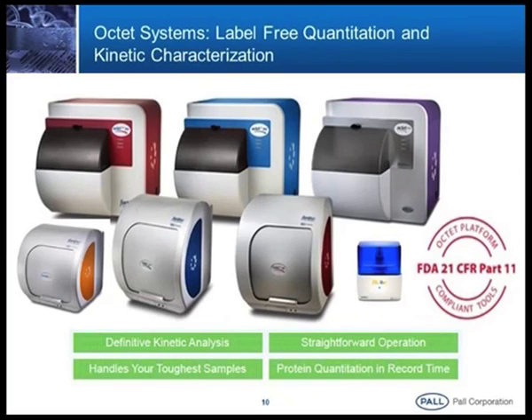Okay. This is the 8 channel instrument that I brought here. At a time you can run 8 samples. You can finish off kinetics or quantitation studies. Say, for quantitation, you are expressing proteins and you have a question about them. With this 8 channel instrument we can measure 8 samples at a time. We can perform different dilutions in kinetics, higher to lower dilutions, and we can conduct kinetic studies here.